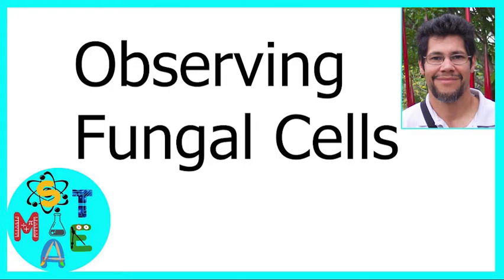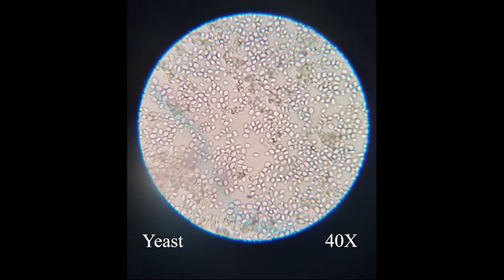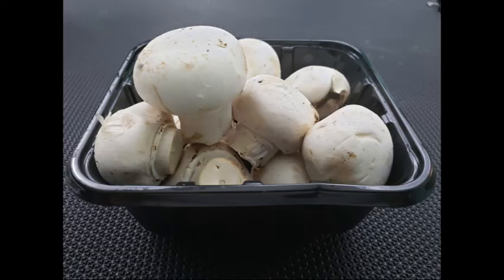Today's episode: Observing fungal cells. Fungi, singular fungus, are non-photosynthetic, heterotrophic eukaryotes. Yeasts (unicellular), molds (filamentous), and mushrooms (fleshy) are different categories of fungi.